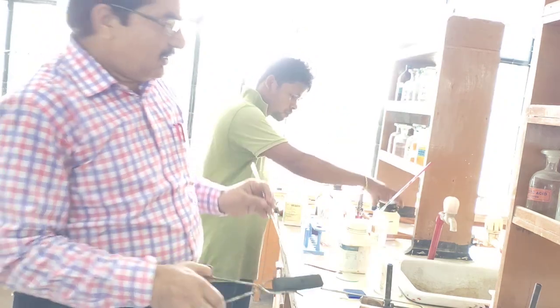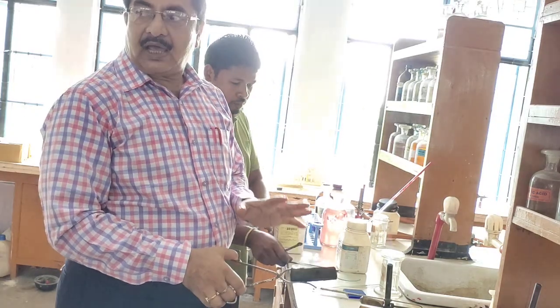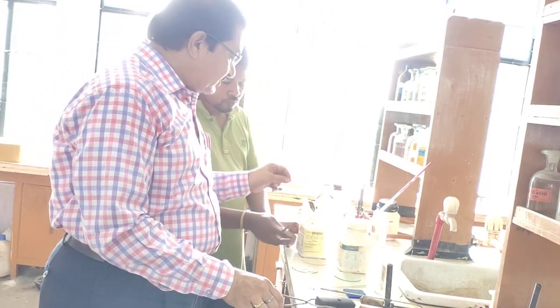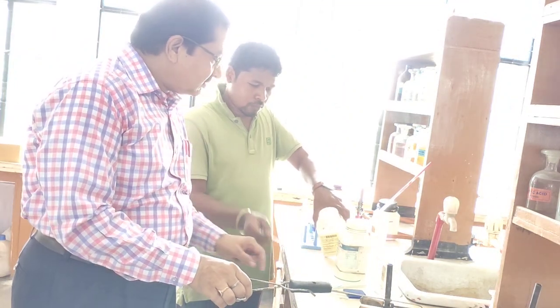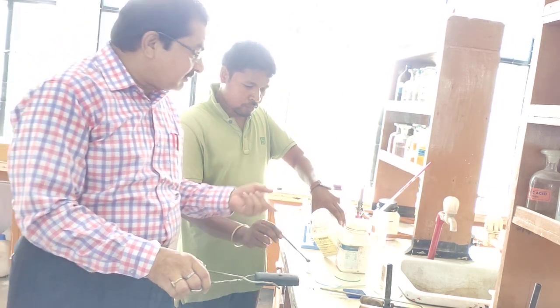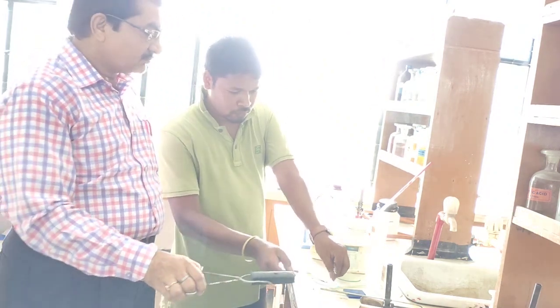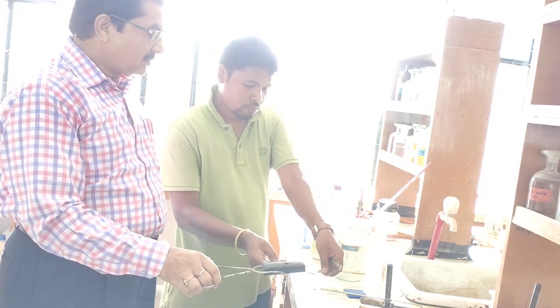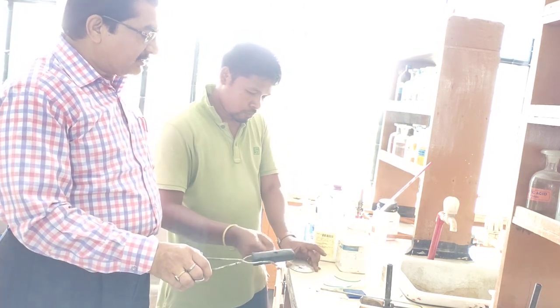In this cavity, we are giving a mixture of salt and fusion mixture. The mixture of salt and fusion mixture we are giving, and you see it is mixed. We are mixing now. See, 3 spatulas of the fusion mixture we have given, and 1 spatula of the salt you give. 1 spatula we are giving of the salt. And now mixing. We are mixing it nicely.